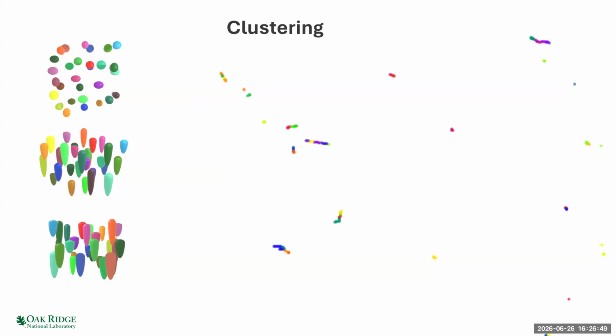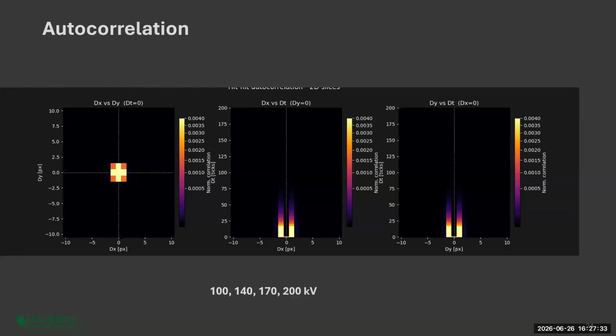If you think about it, you have these clusters, and that's what my little cartoon is indicating there. This is a series of clusters which are different events, and none of them are actually overlapping. But however you look at it, it always looks like some of them are touching. So you have to have some algorithm which can separate those, and depending on whether you have those very small localized events, which are electrons, or whether these are actually cosmic rays, just the background radiation in the lab or coming from the sun, which excite multiple pixels, you can start to improve your algorithms to say that these clusters, which happen over some finite spread, all belong to the same event. And so there's another good use case for AI ML there.